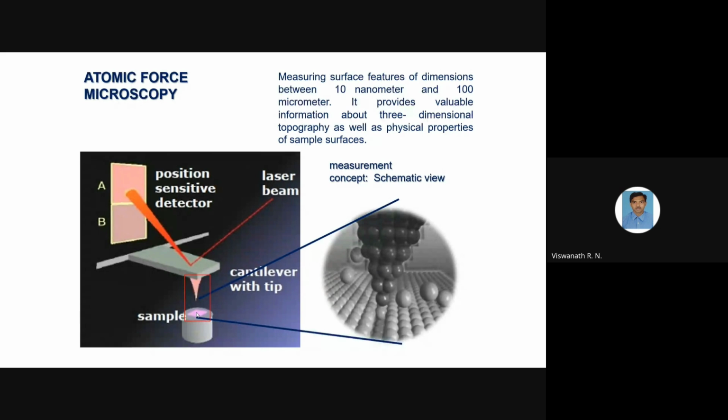So it will adjust the position, then we give the instruction to scan, so it will scan the information, and wherever there are changes from the minimum, it will record the information, whether the structure is dome type or some cavity type. How is it recording? The tip moves like an elastic cantilever, so the force is measured from the interaction. When the object is coming closer, there is a force, and due to that force the cantilever starts to bend.